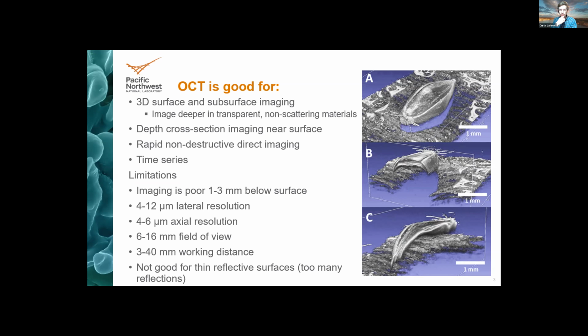Like I mentioned, this is pretty fast and it's non-destructive. So you can do time series. And we found that you can take images over days or longer, just depends on how frequently you want to image. It's only really limited by how much hard disk space you have available on that computer. These 3D tomographic images can get up into the couple gigabytes per image of file size, and so if you think about doing hundreds or thousands of them, it gets big pretty quick.